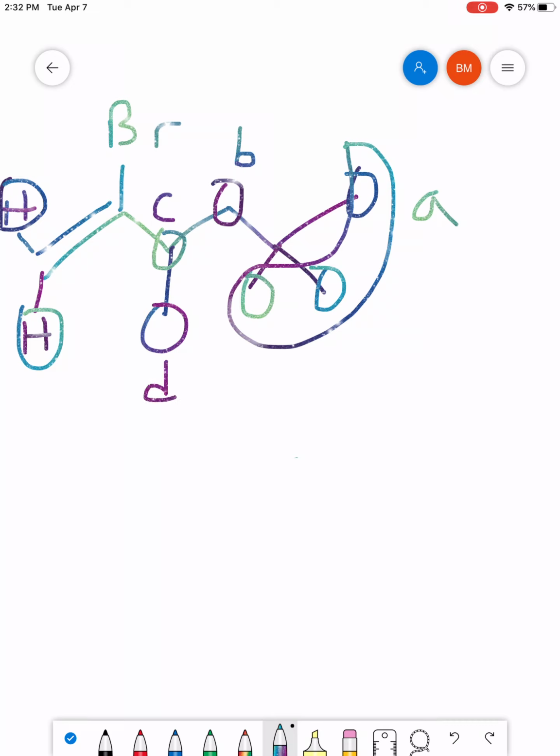This one's unique. And again, I think we can see here that the individual H's that are on the double bonded carbon definitely see different groups. The top H, for instance, is closer to the Br than the bottom H is. So E and F. So this one's going to have 6 signals.